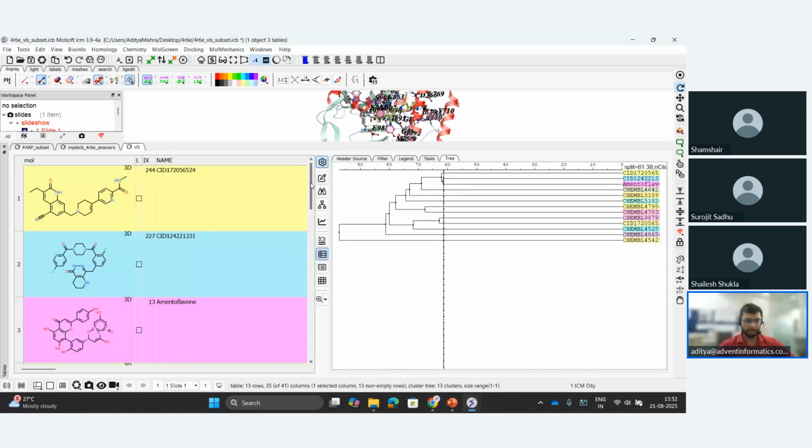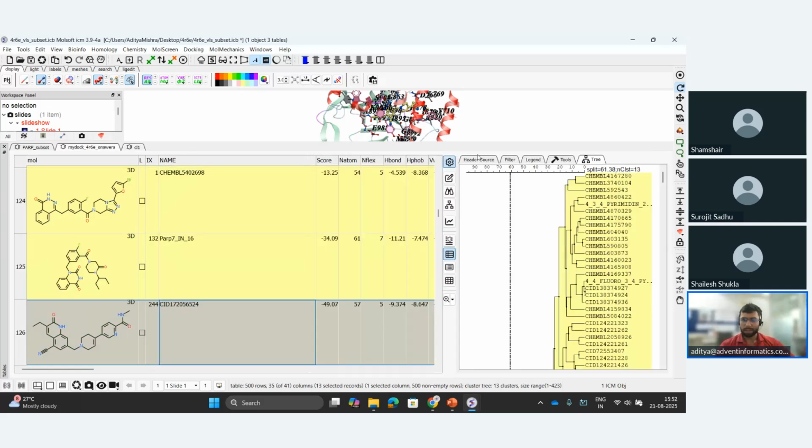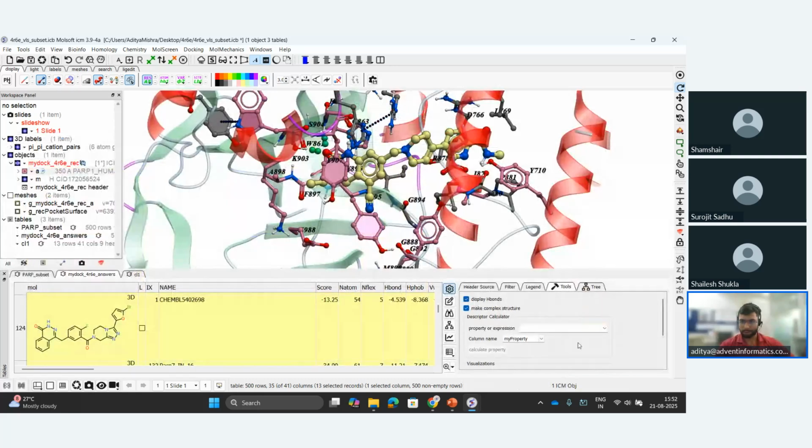And these are the representative from each cluster. Okay. The next option regarding the property description will be to look for interaction list. While we were talking about interactions and residue contributions, we understood that the residues around my binding pocket do interact with my small molecule.